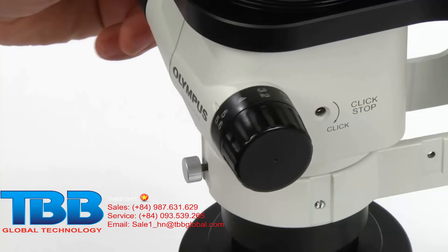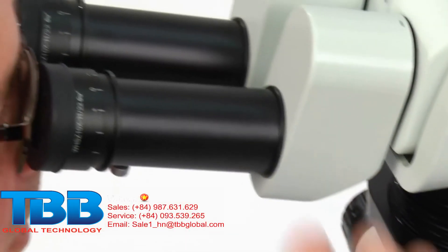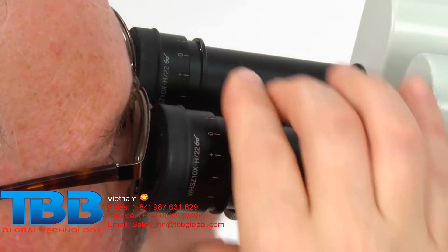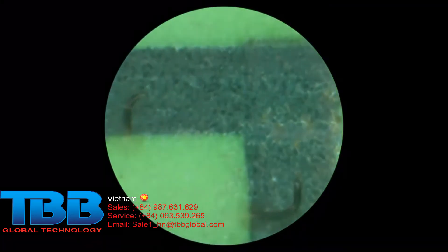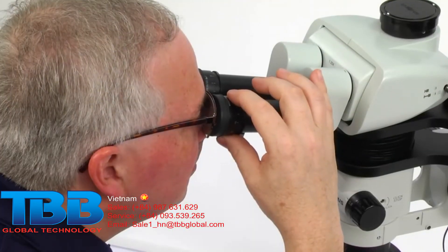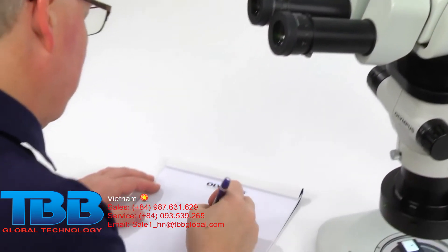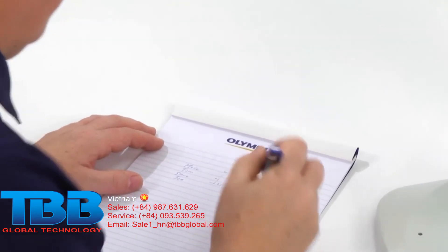Finally, set the zoom adjustment knob for the lowest magnification and rotate the diopter adjustment ring of the left and right eyepieces to bring the sample into focus. The adjustment is now complete and the image should remain in focus from low to high zoom magnification. For stereo microscopes used by multiple operators, Olympus recommends that each operator record their diopter settings, since they will vary between users.